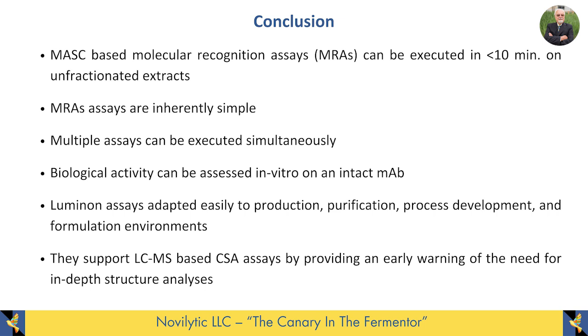And what had happened is that in the formulation, they made a mistake and mixed 2 things together that shouldn't be. And so that's why the early warnings, very rapid analyses in looking at therapeutic proteins is a big deal. And after you do the very early warning, you can go back then and do in-depth analyses in other ways, like by mass spectrometry or so forth, and find out why the molecule didn't work.